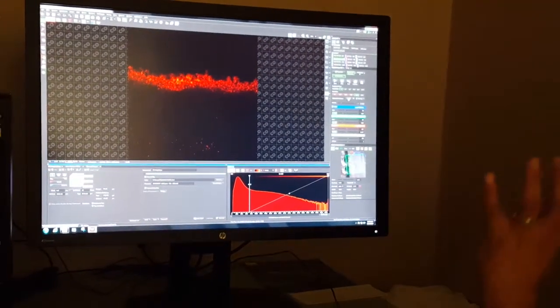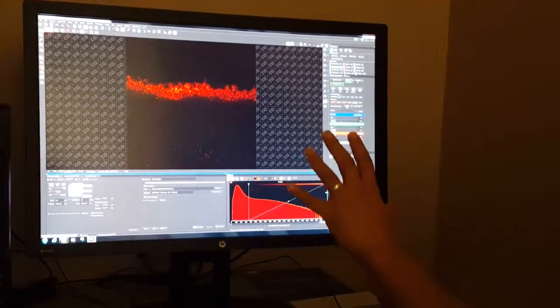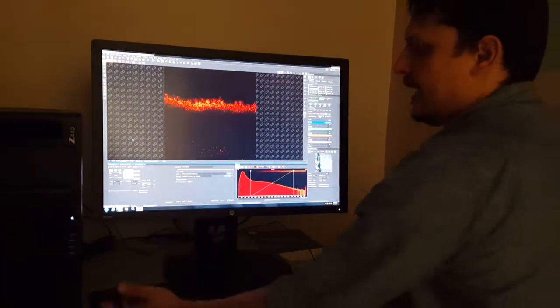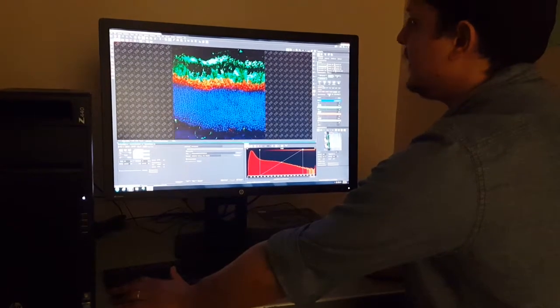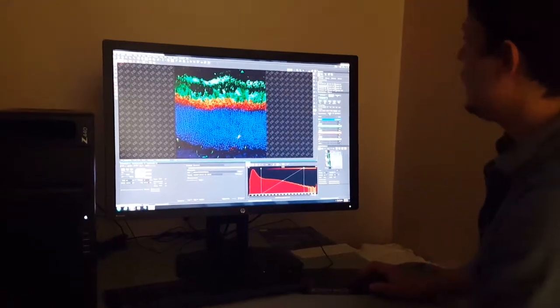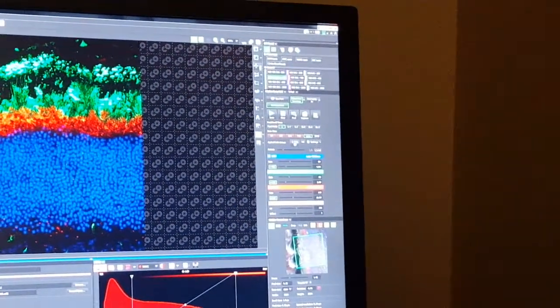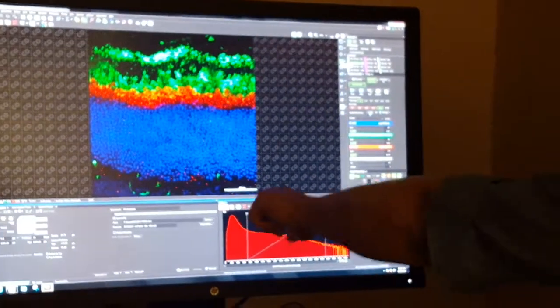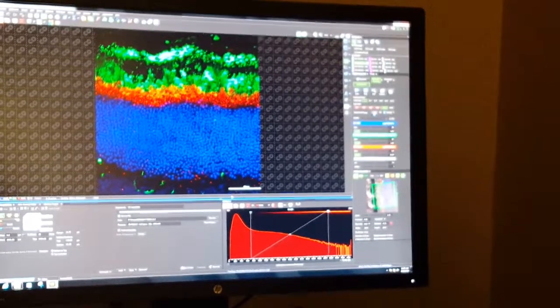In this case, I would like to specifically set what I'm looking for, and once I have it, I want to have it brighter. So now, pressing Ctrl, I can add different layers, and this is a nice picture. In this side of the screen, we can choose to show the scale bar or not. We will leave it here in this case.